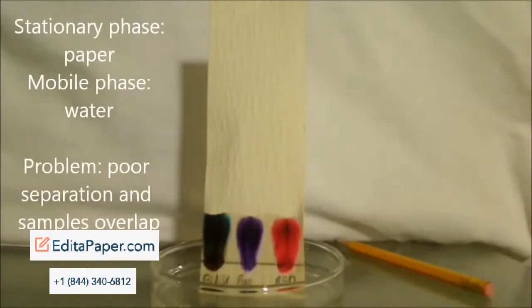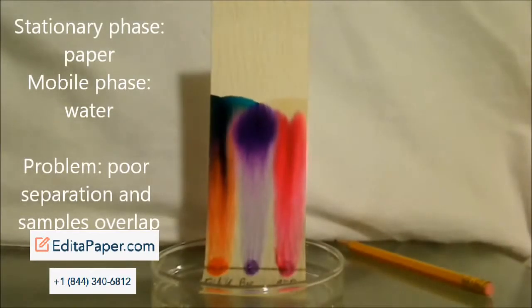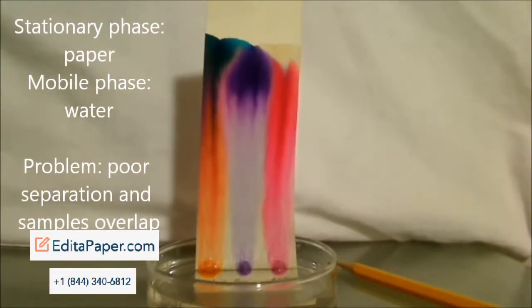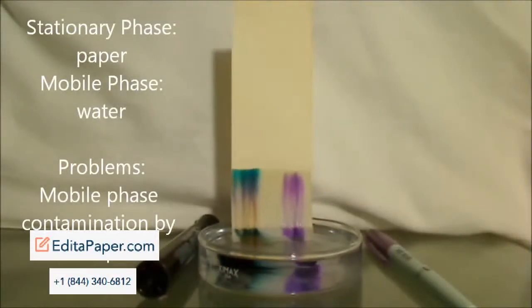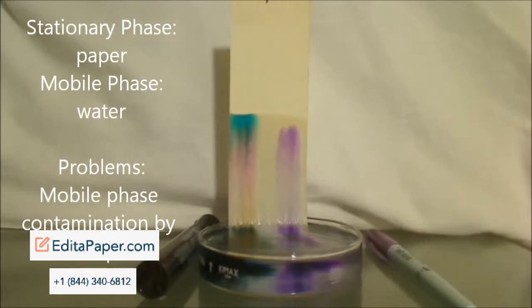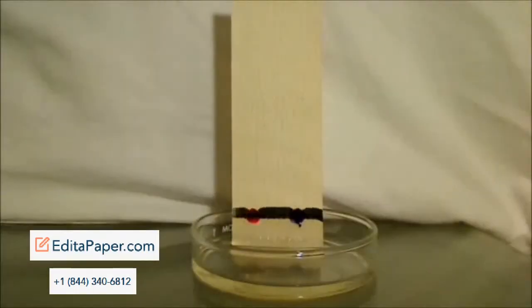Let's look at some bloopers. In this case, the inks are starting to overlap. That's one problem. And the second problem is that pretty much all the ink's going up all the way. There's not very good separation into different spots. Other things that can go wrong is if you put the dots underneath the mobile phase when it's in the container, then the dots will spread out in the mobile phase and contaminate it. So you're not going to get very good results.